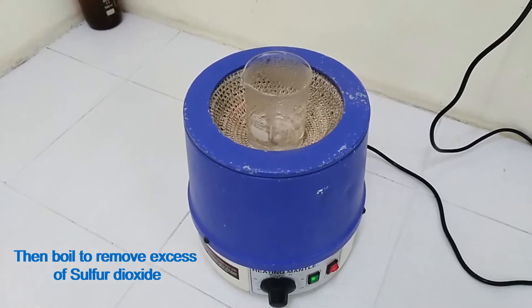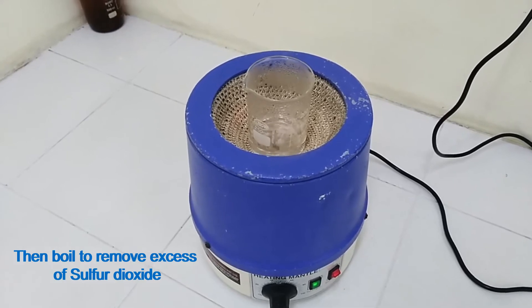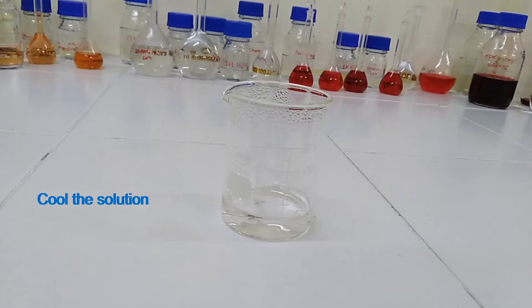Then boil to remove excess sulfur dioxide. Cool the solution.